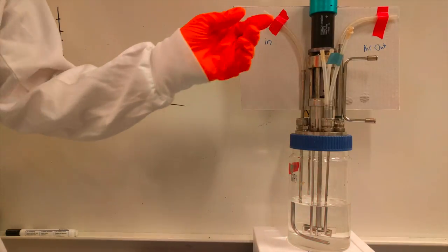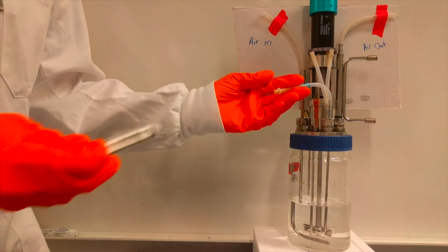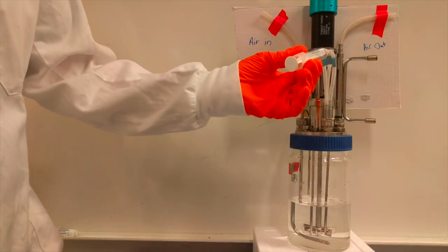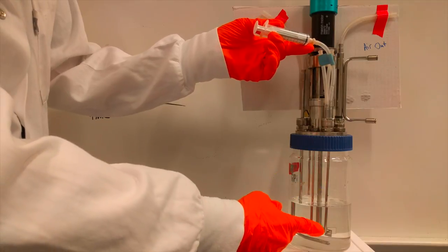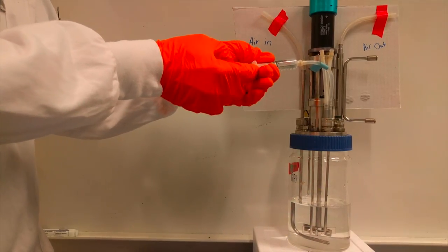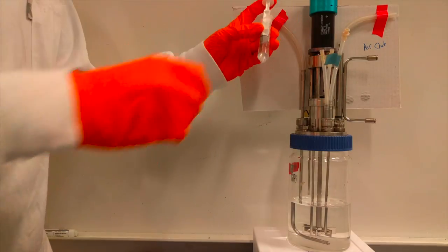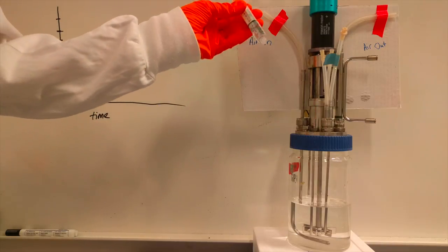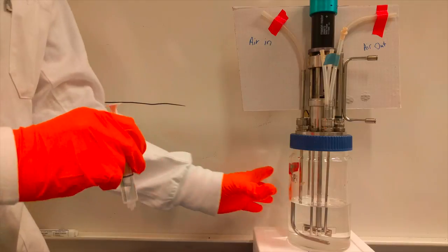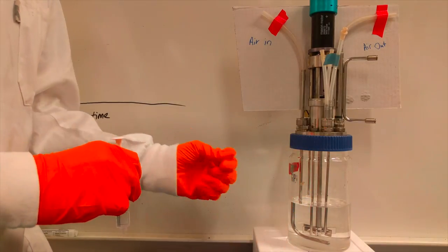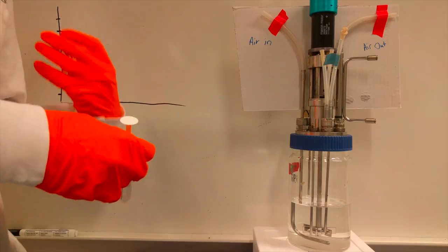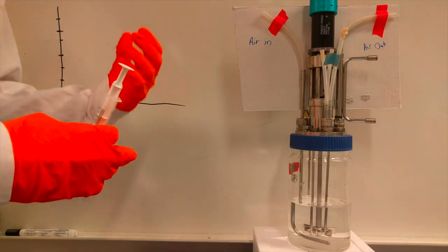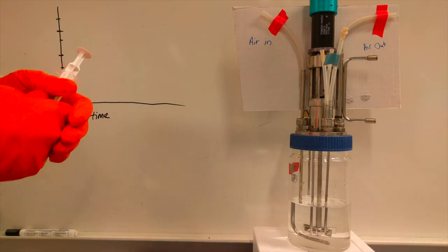I did want to show you quickly the sampling. I talked to you about this before, but I just wanted to show you what it might look like. So we can hook up a syringe here. This goes down below the level of our media, and that allows us to draw media from the vessel itself. What we would do with this media and cells in a real reaction is we would trace what metabolites were in the media at that moment, what metabolites were inside of the cell, what RNAs or proteins were inside of the cells. From all of that, we can learn more about our process and make it more efficient.